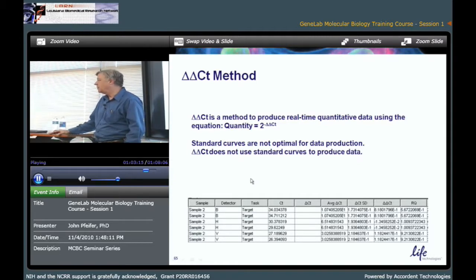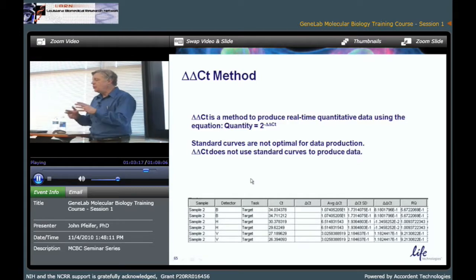That's your absolute calibrator. And it has to be RNA in that case because we have to take into account reverse transcription efficiency. So for a DNA sample, going back to the adeno example, what would you do? Spike DNA onto the actual index? Yeah, so again, it depends how you want to normalize your data. Like in the example I gave where the researcher wanted to normalize the data based on copies of human DNA, then you take the control human DNA, you mix in a known number of copies of the pure adeno clone, there you go, you got it.